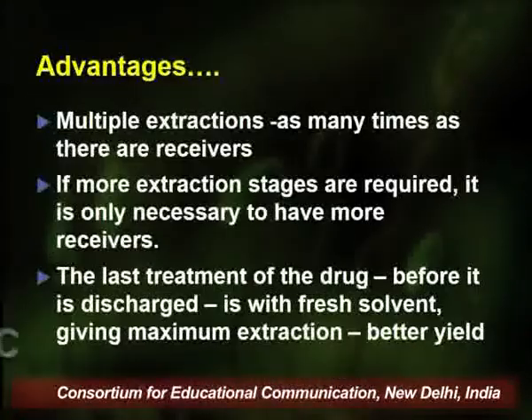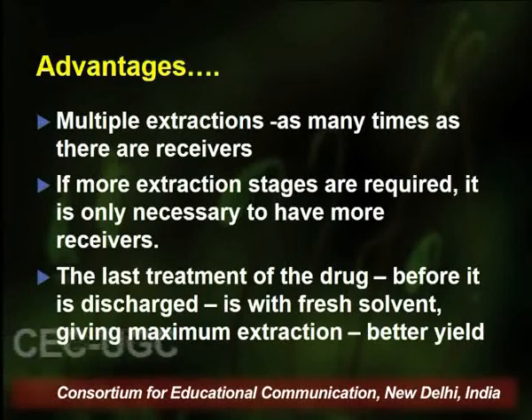The last treatment of the drug before it is discharged is with the fresh solvent. As we discussed, whenever the drug is treated with the fresh solvent present in the third container, the drug has already been extracted with the solvent in the first 2 containers.